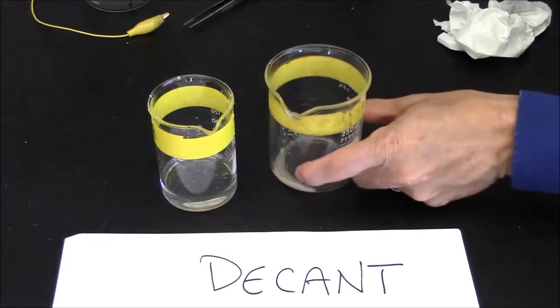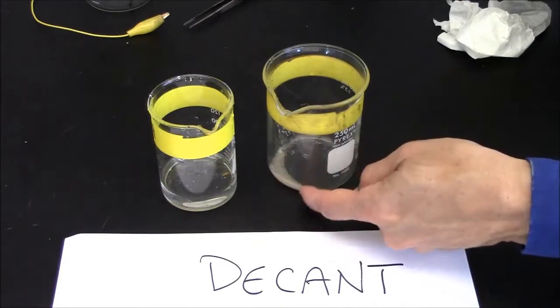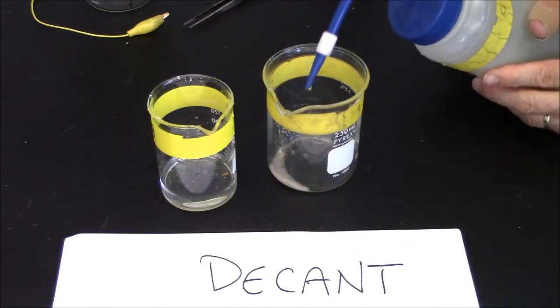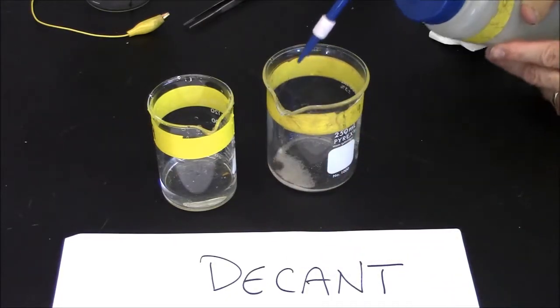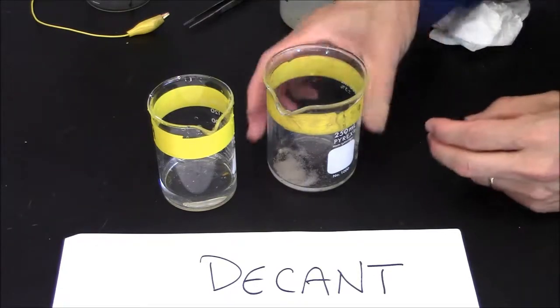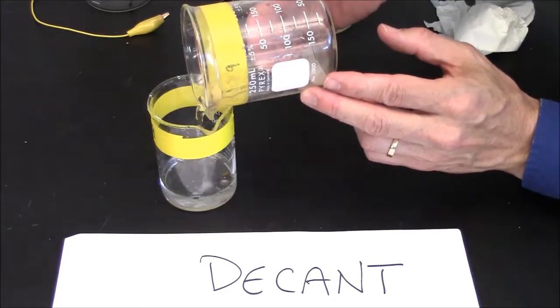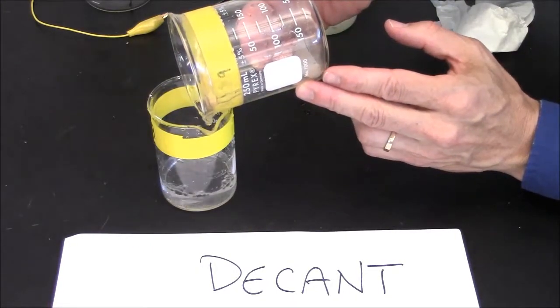And this is a quick and easy way to separate liquid from solid if the solid is fairly dense. And now I can rinse my sand and say this will be the cleanest beach sand ever. Rinse with distilled water. Decant the liquid.